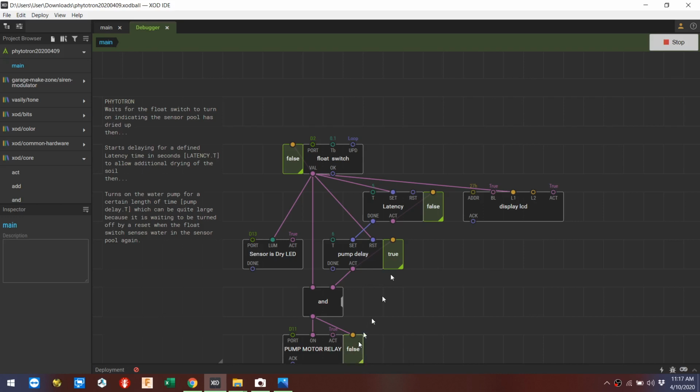Oh, wait, I'm sorry, we were still in these delays here. I'm going to do it again now. So I'm going to do, that's true. I'm going to let this go to start the pump up after 5 seconds, and now I'm going to let go right now, and it turns false. Okay, so this is cool.